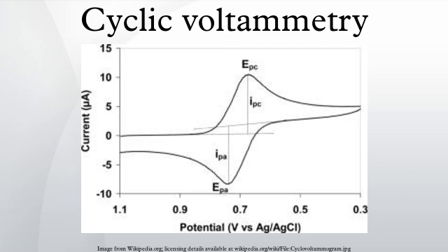If the redox couple is reversible, then during the reverse scan the reduced analyte will start to be reoxidized, giving rise to a current of reverse polarity to before. The more reversible the redox couple is, the more similar the oxidation peak will be in shape to the reduction peak. Hence, CV data can provide information about redox potentials and electrochemical reaction rates.